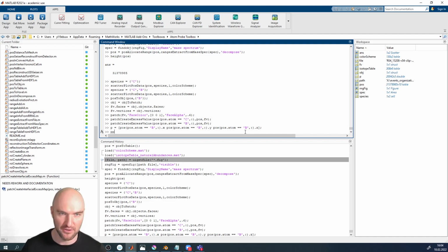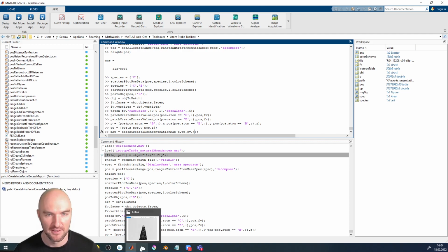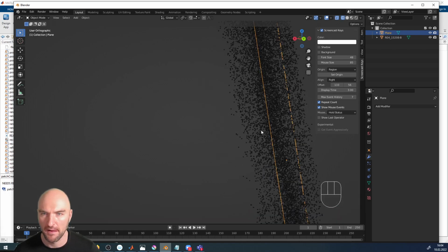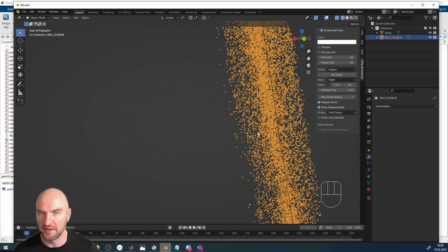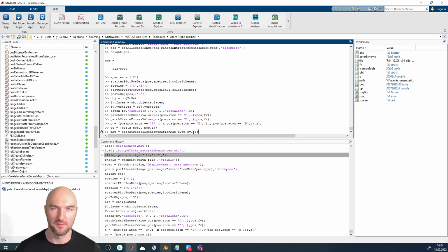So we'll definitely make it so that you can just use the usual ways we do it in the toolbox. In this case, I don't know, is 4 nanometer a good measurement? We can have a look. Maybe 4 or 5 nanometers. Why not? Maybe we'll make it 6.